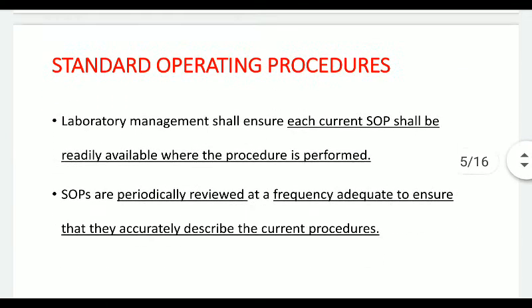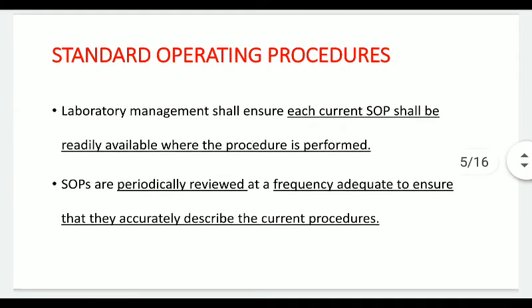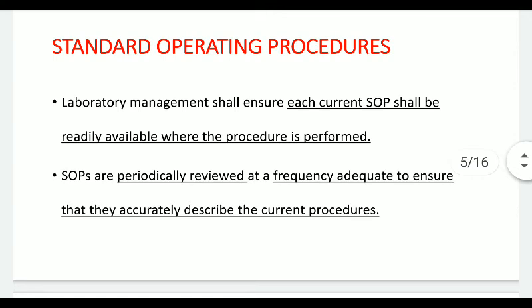The next set of guidelines are specifically pertaining to the standard operating procedures. Now, the standard operating procedures are not only limited to LIMS, but whenever you go in any pharmaceutical industry, each and every department is having standard operating procedure. So it has become a very integral part of the quality aspect in specifically the pharmaceutical industries.